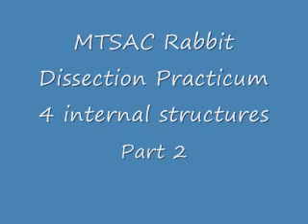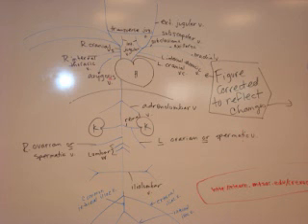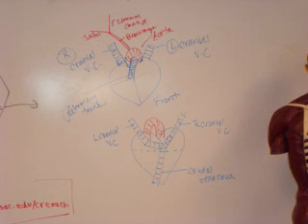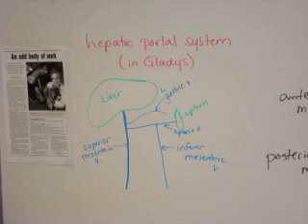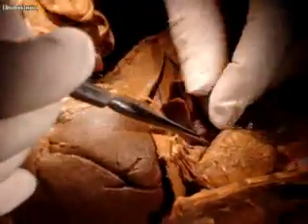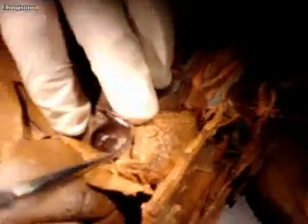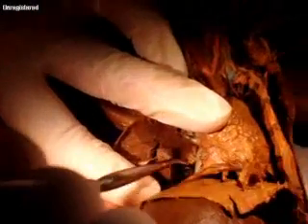I'm pushing down on the diaphragm. If you look in the back here, there are a couple things you're going to see. If you fold the lungs down, between the lungs and the heart, down here at the bottom, you can see the caudal vena cava coming up from the bottom. Do you see it? That's the blue one — the caudal vena cava.